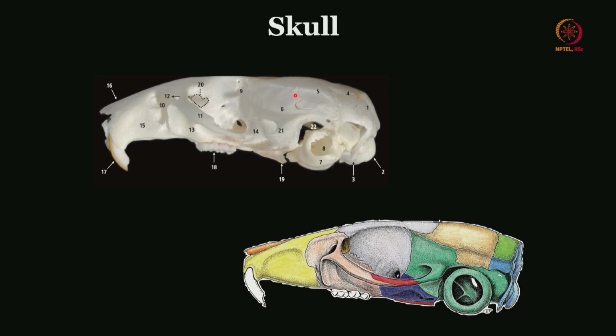Again, that is the cadaveric structure. This is an illustrative picture to show the different components. So the frontal bone drops vertically from that edge. That is the frontal ridge there. That point is again the bregma, and this is lambda, and it is very important when we are doing stereotactic experiments to maintain the bregma and lambda in one horizontal plane. It is very vital, and there are techniques explaining how to maintain that. We will discuss it in detail later.